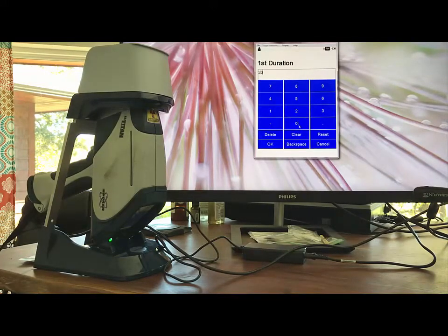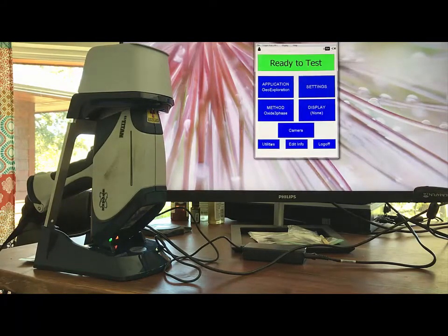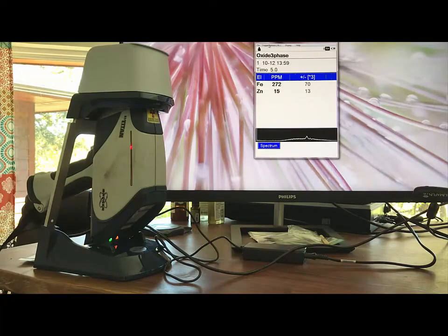The earlier phases find the heavier metals, and the later phases find the lighter elements like calcium. The red light is now on — the gun is irradiating the sample. It's going through the 20-second first phase, finding iron and zinc, and it just found copper. As it elapses into the second phase, it will find more elements, and moving into the third phase, it will find what we're most interested in: calcium from the stabilizer.